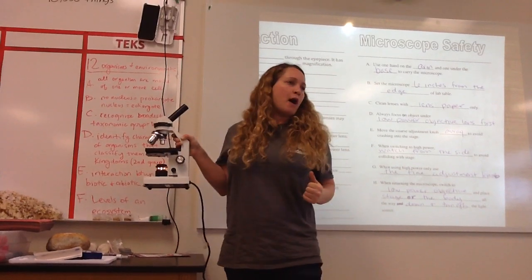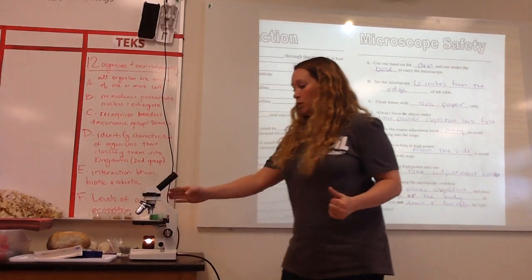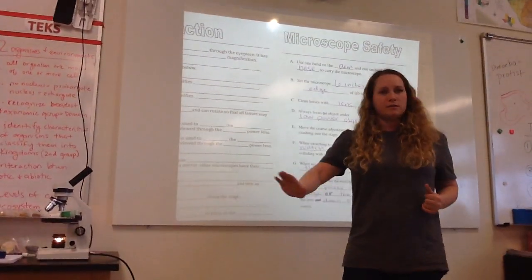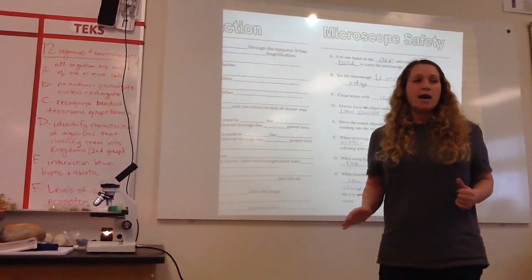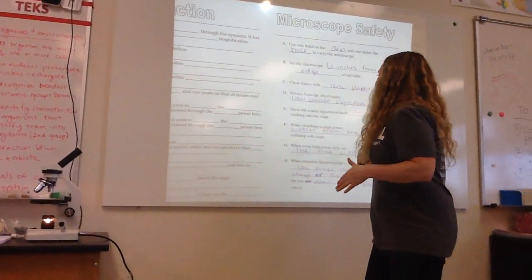So your lowest power is your shortest one. As I said before, you always start there. So it's on its low power objective. It's clicked into place. The light is on. It's 6 inches from the edge. My checklist in my mind is going well. Does it make sense? Okay.